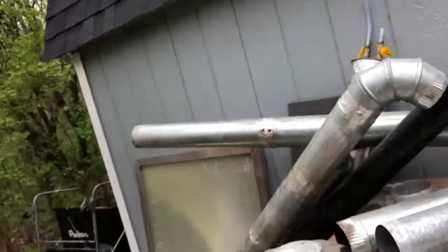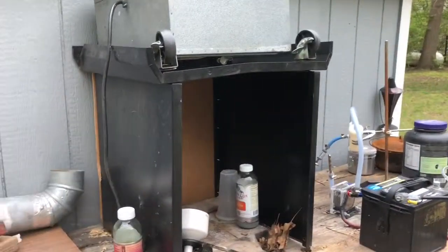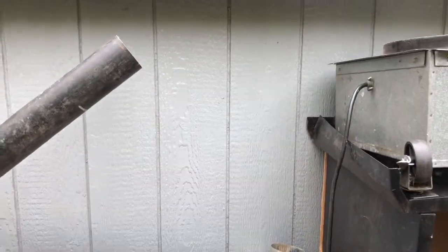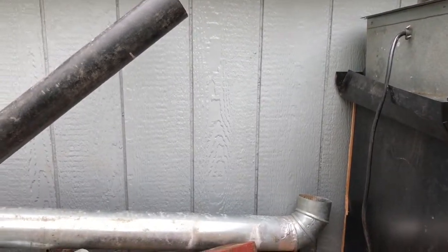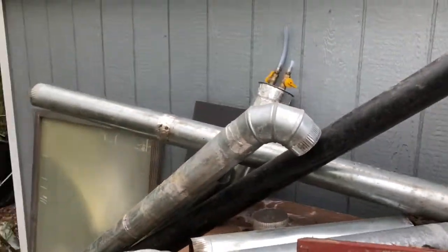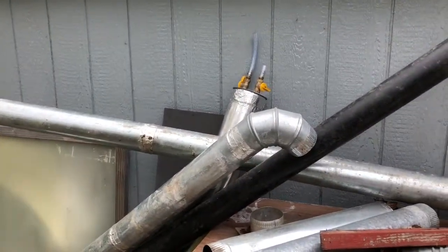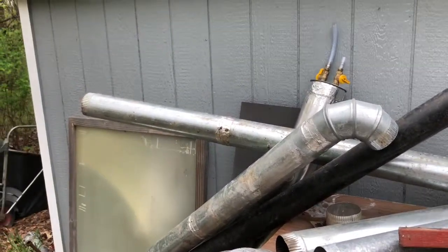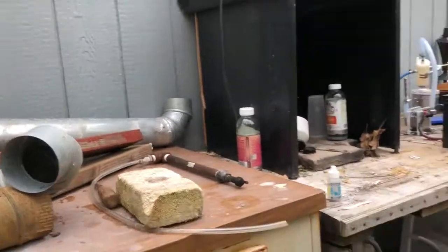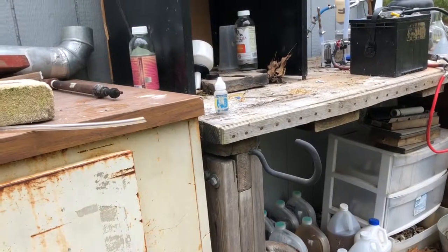This is all the ductwork I have available to use. What I plan on doing is putting a cover over the top of the fan right here, which I'll then connect the ductwork to, and with multiple elbows I'll connect that to a straight shot along the roof there — and then either straight out into the woods or maybe around the back of the shed. That might even be safer because then I'll be well away from it. So that's the plan. Until we meet again.